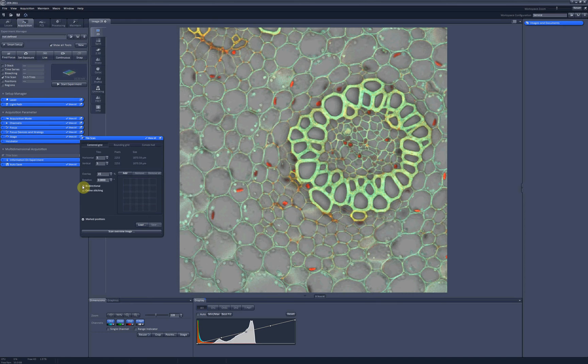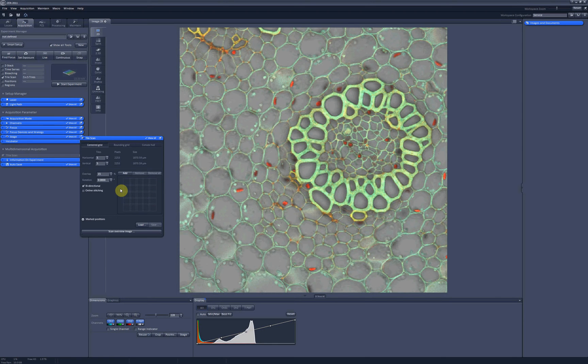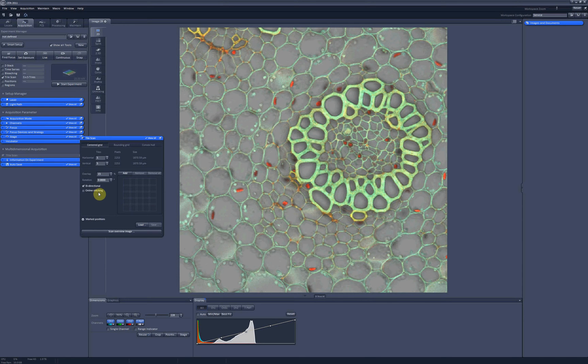There are such options as bi-directional scan, in which case the tiles will be scanned from left to right and then from right to left. It might save you some time because you reduce the movements of the stage. There is also an online stitching which to my experience doesn't give as nice result as post-processing stitching. So I wouldn't advise to use it.